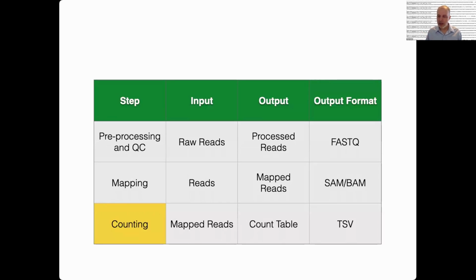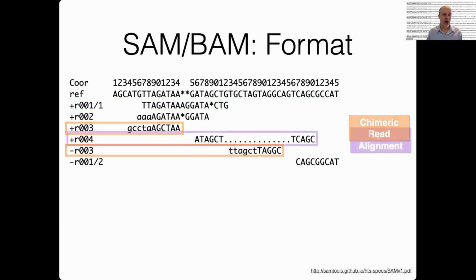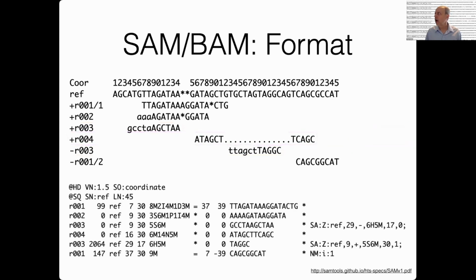Why are some bits capitalized and others not on the BAM file? So good question. I don't think you would actually see that in a real BAM. So this up top here is actually not the BAM file. This is sort of a toy representation. It's missing some stuff. But here the lowercase bases are showing you where this is a read, and it's showing you where those lowercase bases are positions that actually don't match the reference. So it's kind of to indicate that.